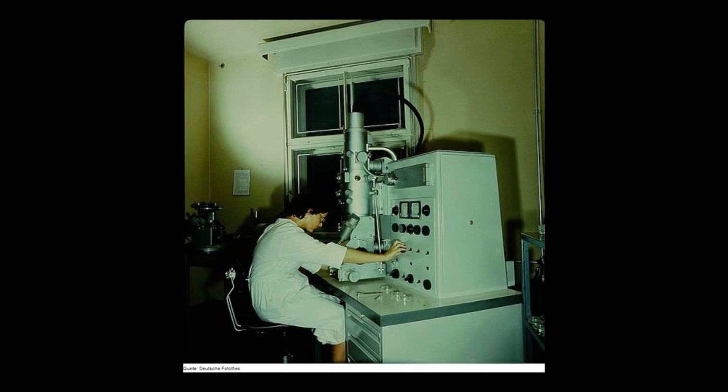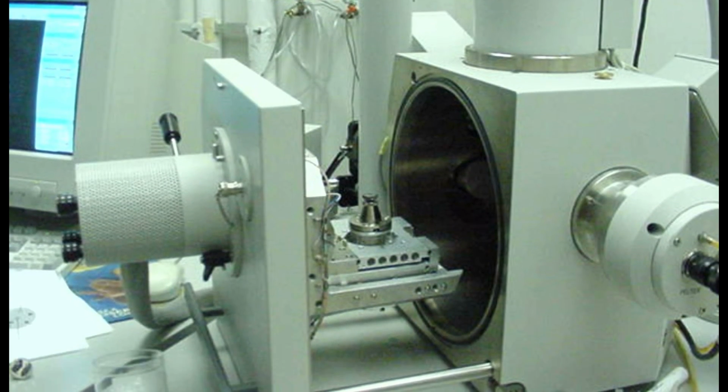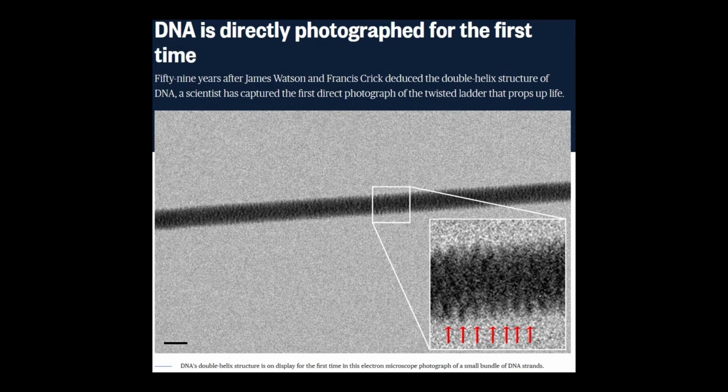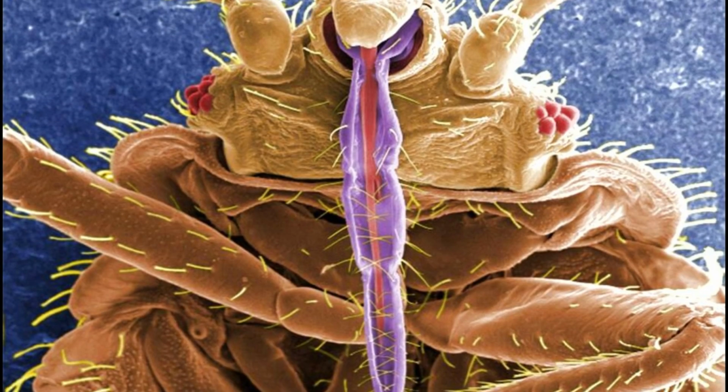People started using the first microscope like that back in the 1930s, and since the 1950s electron microscopy became widespread and widely used among scientists. New branches of science appeared, new research, and a lot of discoveries were made. People could observe for the first time things like human genes and make revolutionary discoveries in the bacterial world, viruses, physics, geology, and engineering.